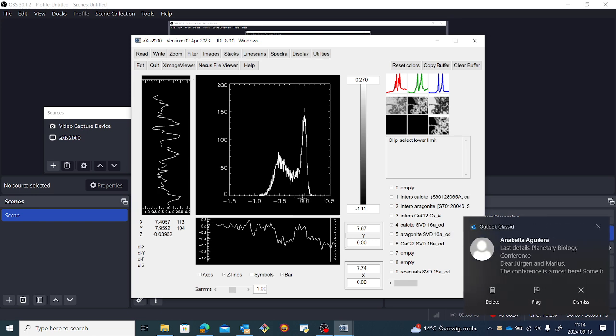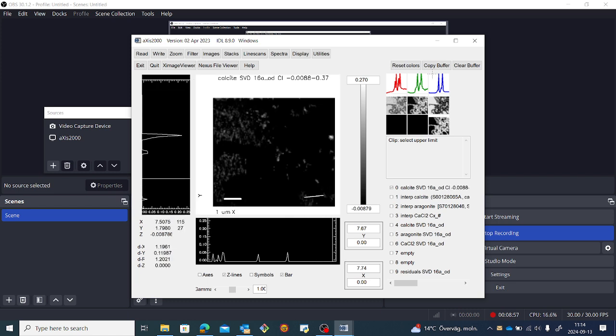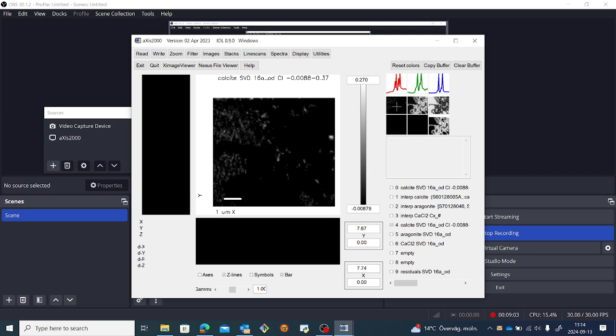So I left click on 0 and then click somewhere towards the upper limit. I can choose to only stop where the histogram ends or to go up to the maximum. When I'm done, I should copy the map and place it in the buffer. You can place it in another buffer if you want.